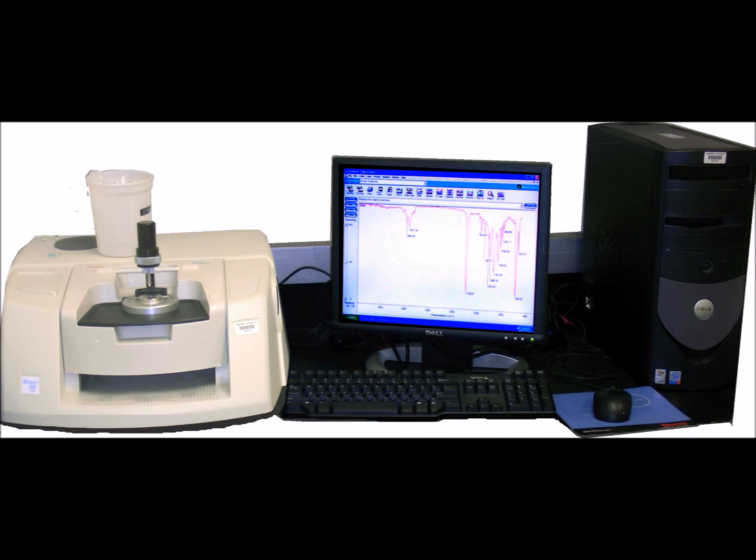The signal processor plays an important role for FTIR spectroscopy in that it performs a Fourier transform conversion from the time domain to the frequency domain, a process that would be extremely difficult and time-consuming if done by hand. Like many other analytical instruments, the signal processor is the computer.